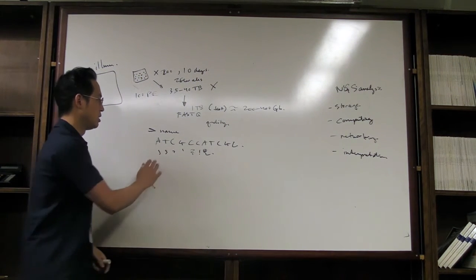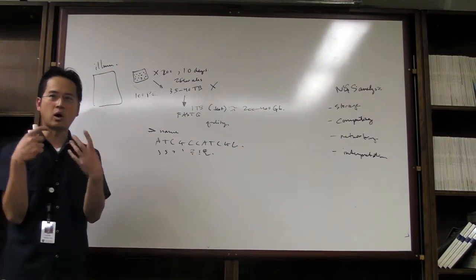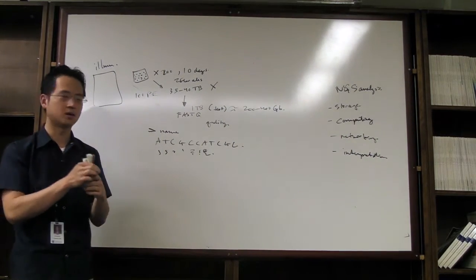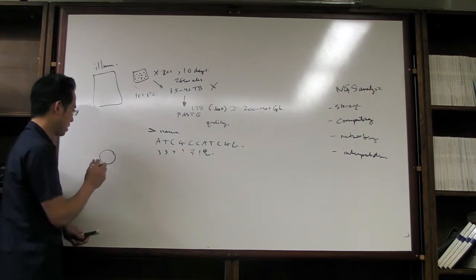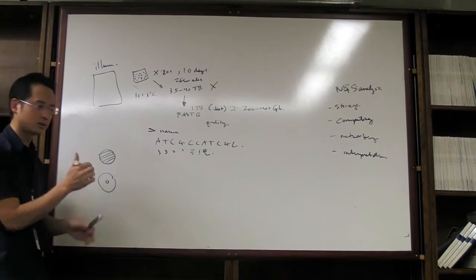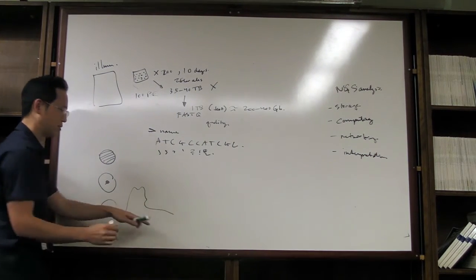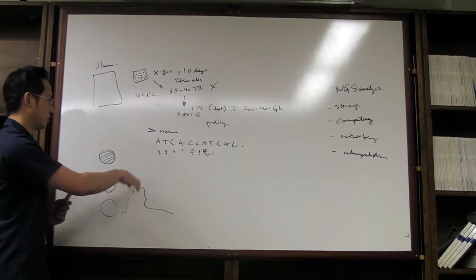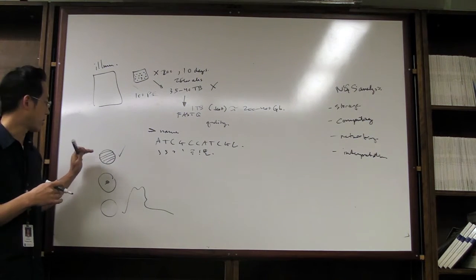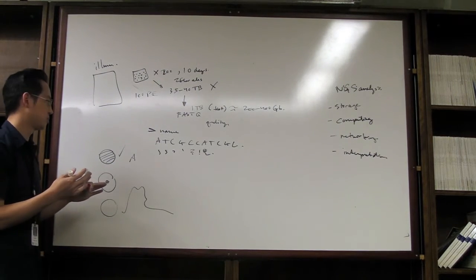Why do you need this? So you need this because during the sequencing step, the sequencer knows what quality of signal was taken from that image, how bright it is. So let's say here's a circle, right? It's going to say how bright the signal is, how large the signal is, maybe over time, like how brightly it shines or whatever. So a combination of this, they have modeled within their system to say, reliably, if it's this bright, 95% of the time I'm correct if I call this an A. If it's this weak or that poor, 50% of the time I'm correct.